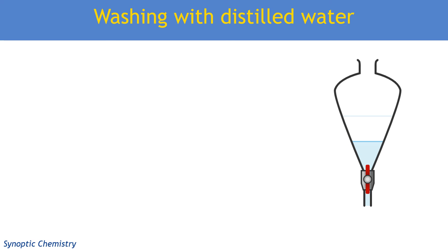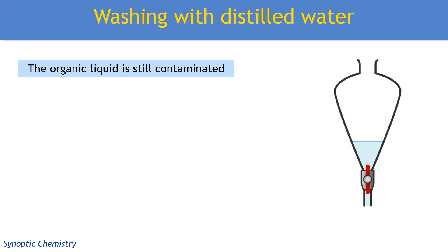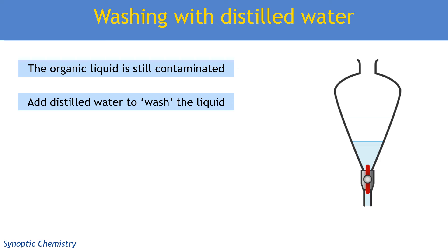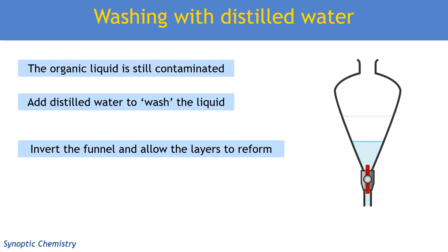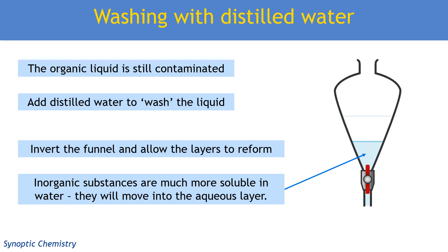You've now neutralised the acid, but your liquid is still going to be contaminated. There's going to be excess base and also salt from the neutralisation reaction. So you now wash your organic liquid — add distilled water, invert the flask to mix the liquids together, then allow the layers to reform again. Any inorganic substances such as excess sodium carbonate or the salt from neutralisation will be extremely soluble in water and much more soluble than they are in the organic liquid, so they will move into the aqueous layer. As before, open the tap and remove the aqueous layer. You may need to do this a couple of times.